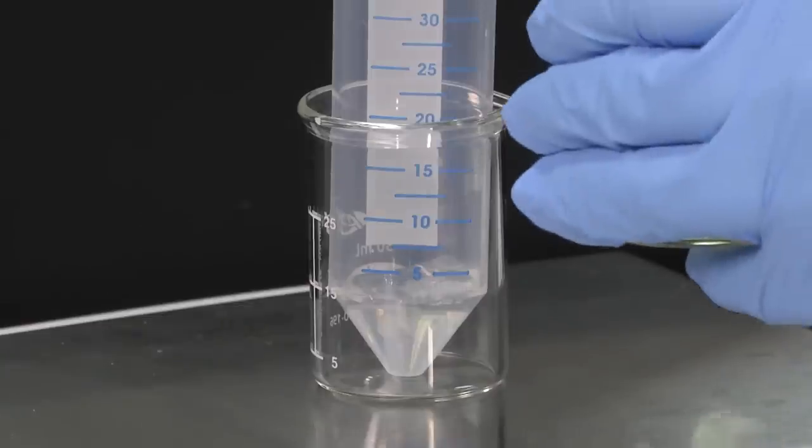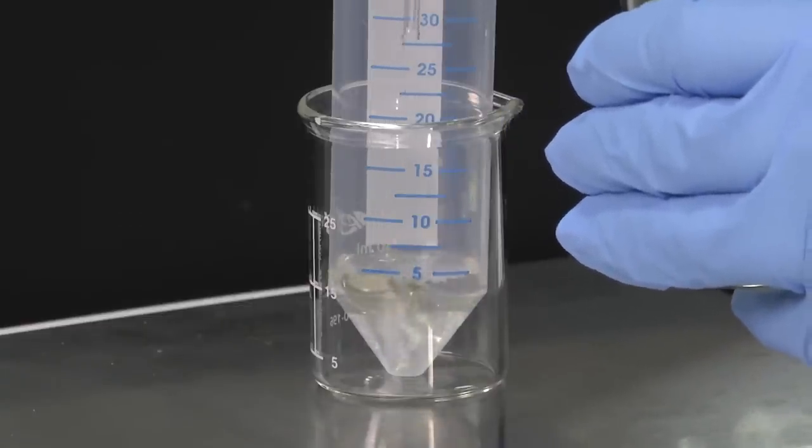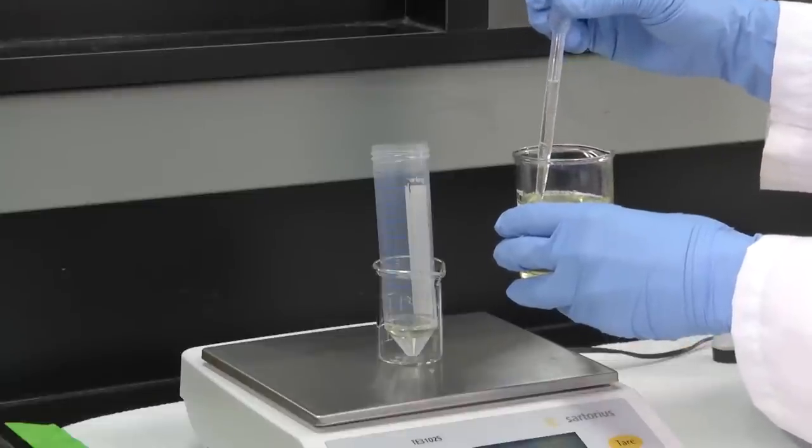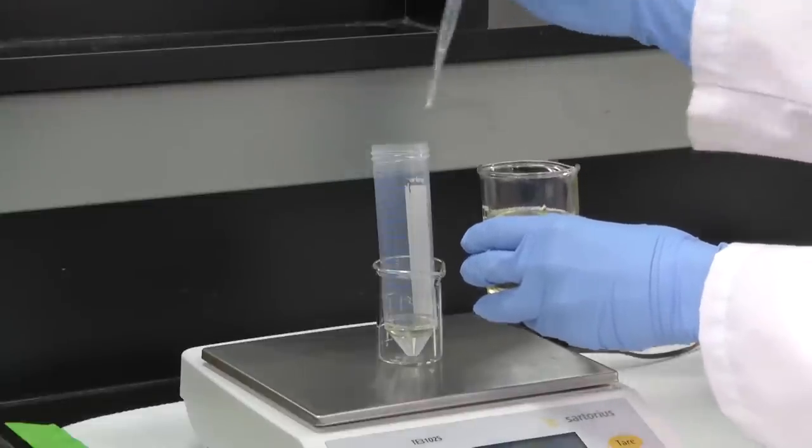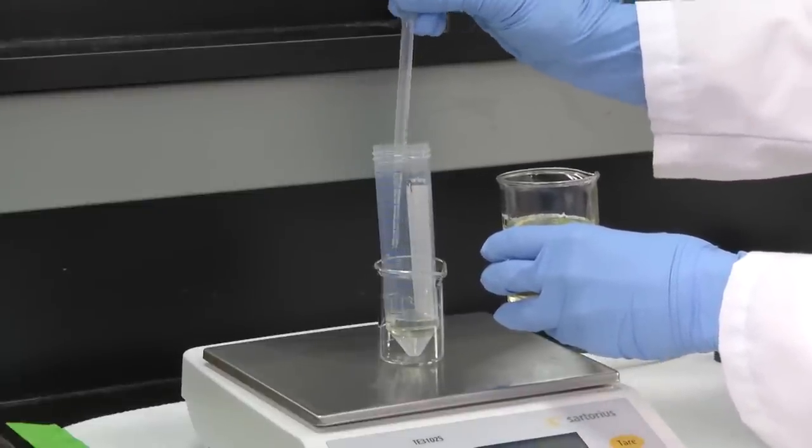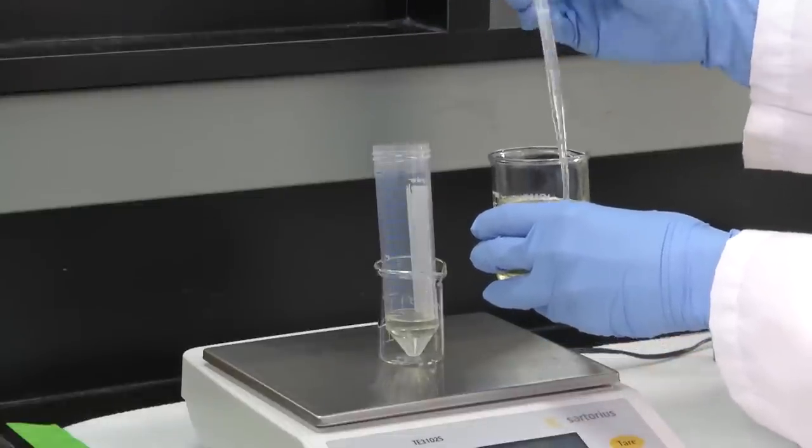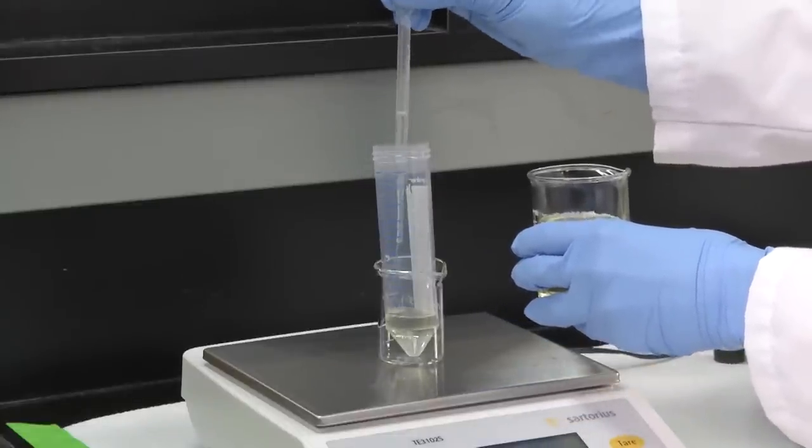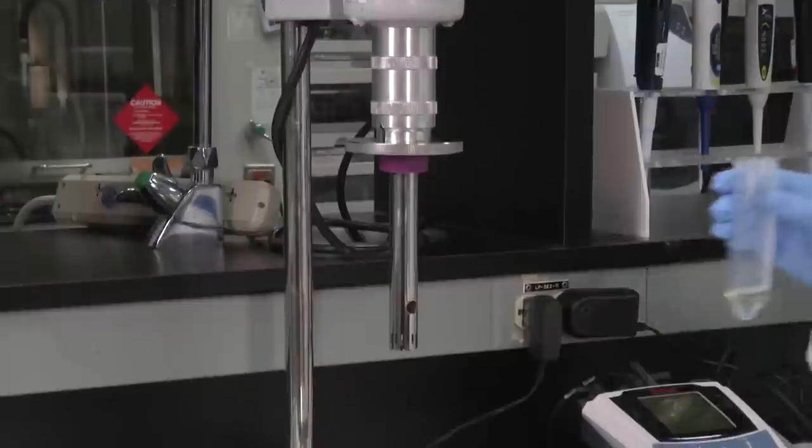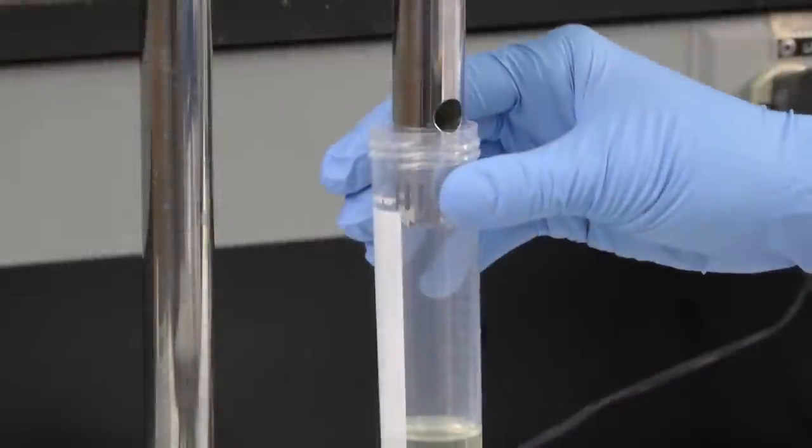For the next emulsion in our series, add 6 grams of oil to 2 grams of protein solution already weighed into a 50 milliliter centrifuge tube. Homogenize for 5 minutes at speed 4.